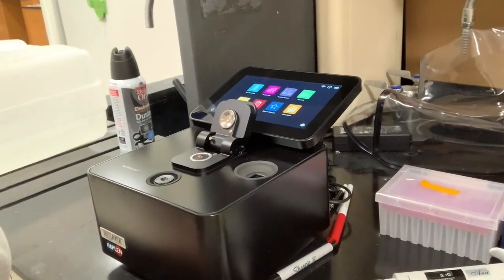So this video is going to involve using our spectrophotometer to determine the concentration of nucleic acids. If you do a mini prep, you might want to know what the concentration of that is. If you've purified a PCR product or a digest, you will probably want to know what the concentration of that nucleic acid is. And so we have this machine in the lab. Here, it's back here on the DNA gel bench, called a spectrophotometer.